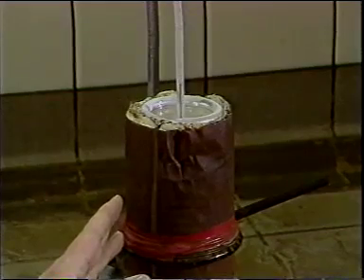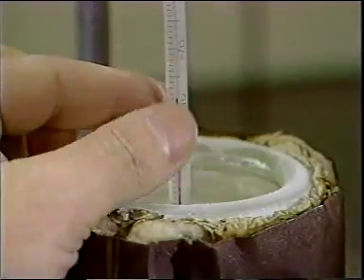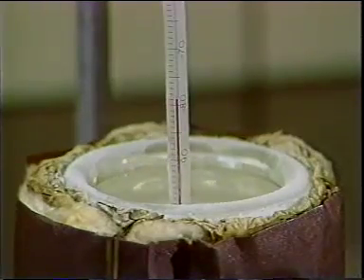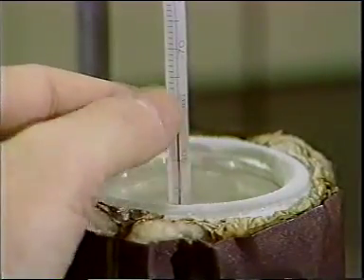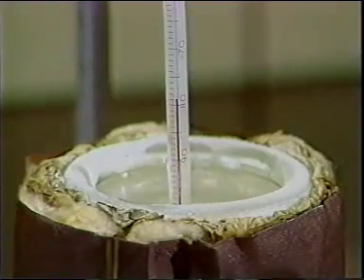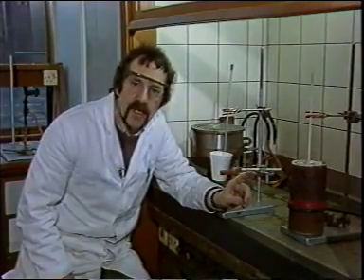It is acetone and dry ice, the same that we used for cooling the traps in the oil pump. A temperature between minus 70 and minus 80 is easily achieved here. You can see that the thermometer is reading round about minus 80 degrees. We need to use a spirit thermometer to measure these temperatures because mercury would freeze.